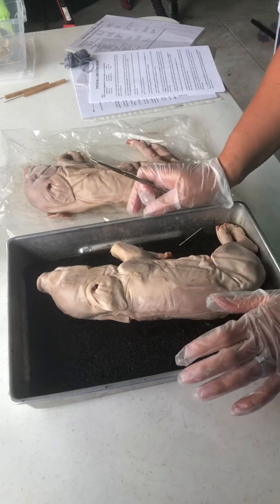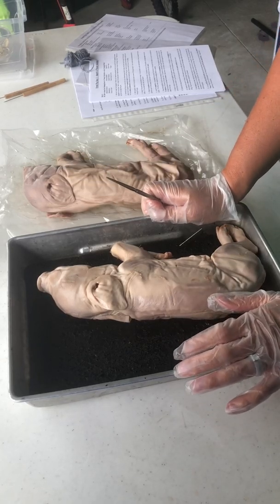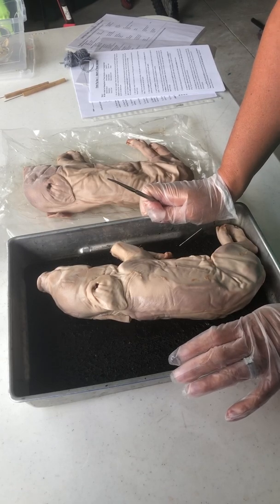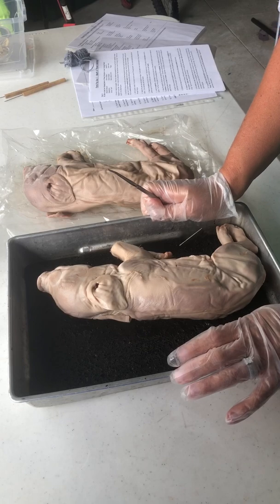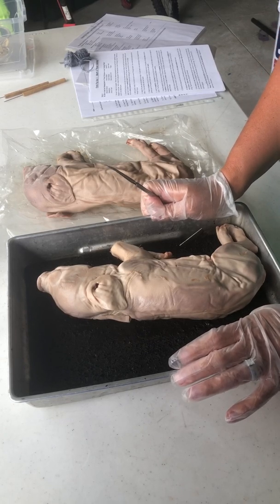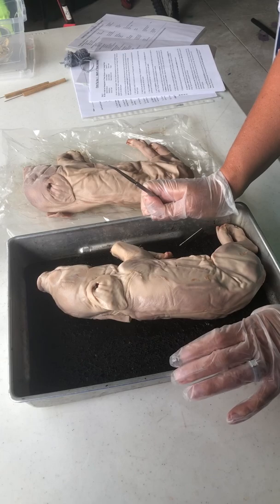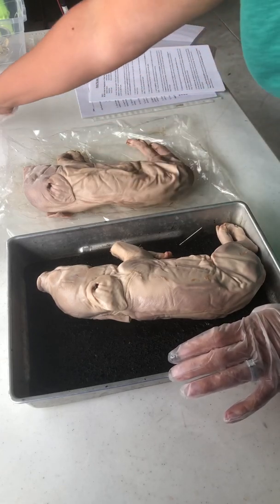So for day one of fetal pig dissection, you should be following along in your day one packet, and we are looking at external anatomy. There is a list of structures that you should be able to identify as we move along, and you should be able to follow along in your dissection packet. And I'm going to go step by step as we go through this.